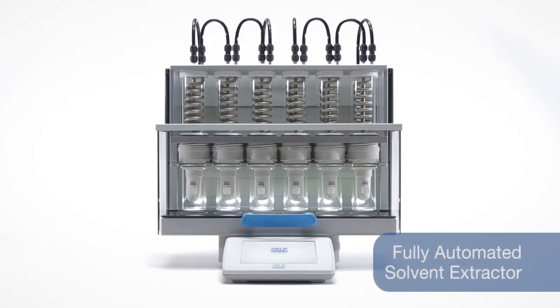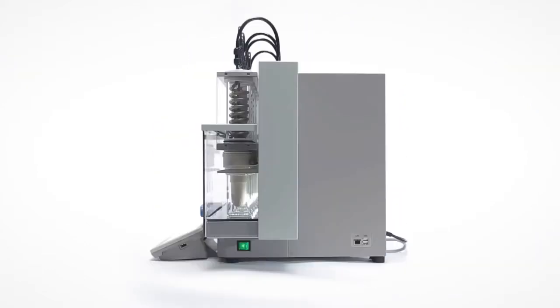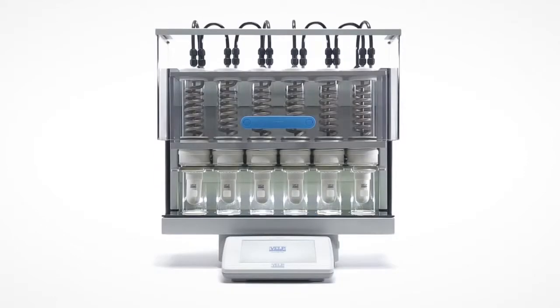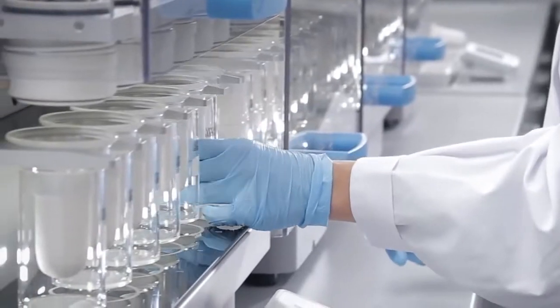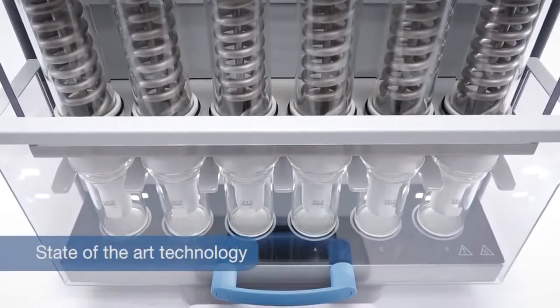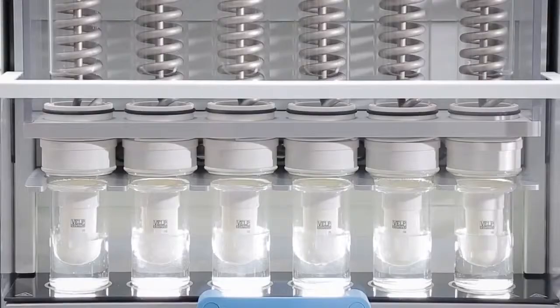With the new S.E.R. 158, VELP Scientifica takes another step ahead in raising solvent extraction to excellence. A fully automated solvent extractor combining state-of-the-art technology with innovative solutions for accurate and safe fat determination according to the Randall technique.